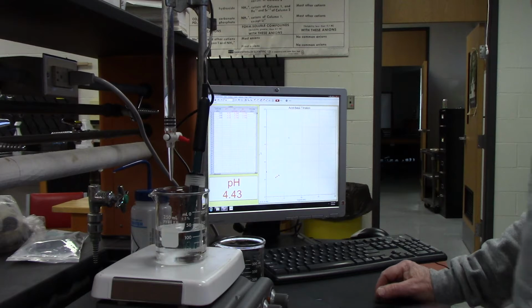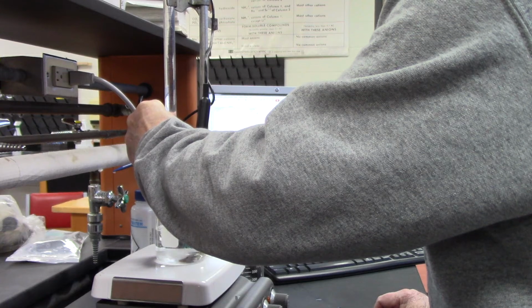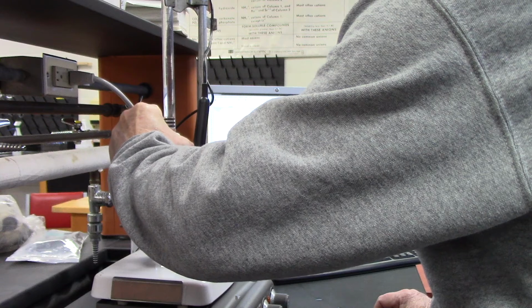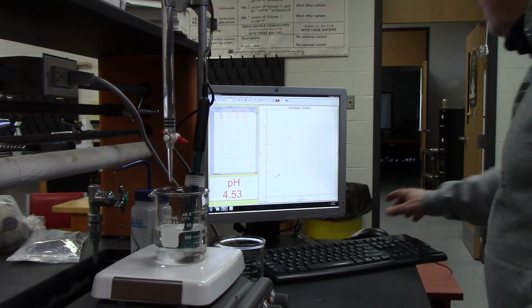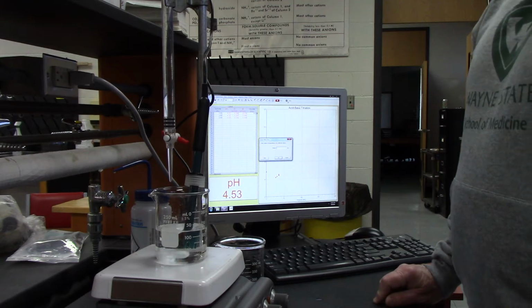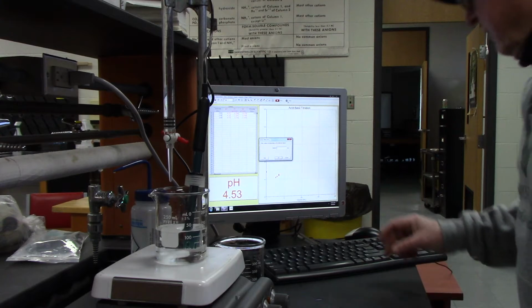All right. So I'm going to add again. So it goes up to about 4.5. And so it's 4.53. Let's say 3.75.